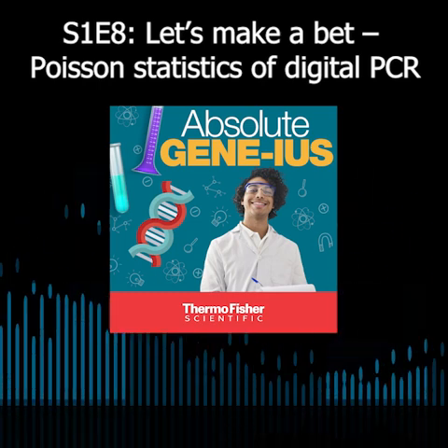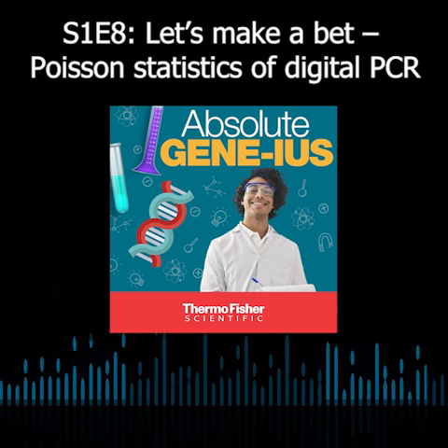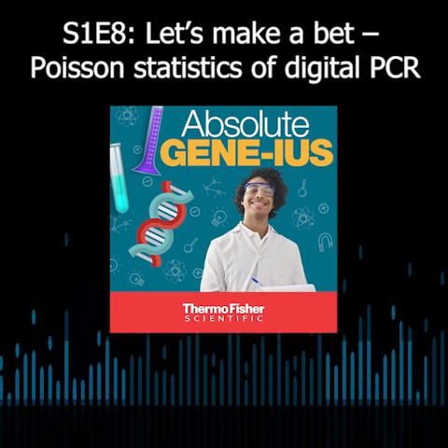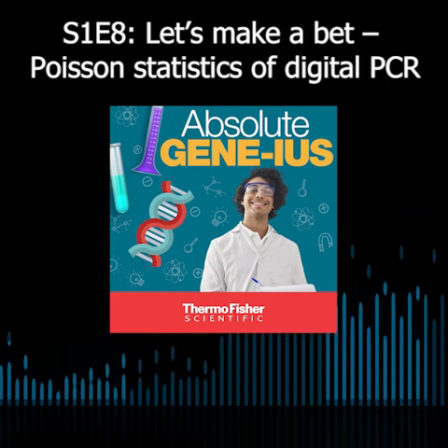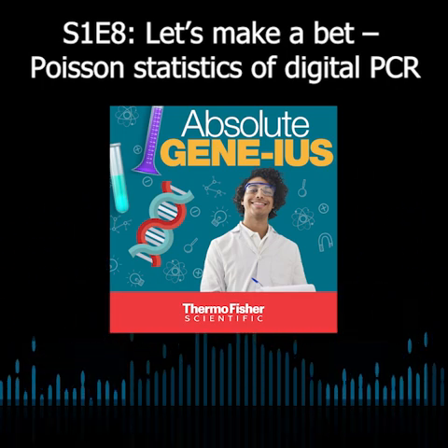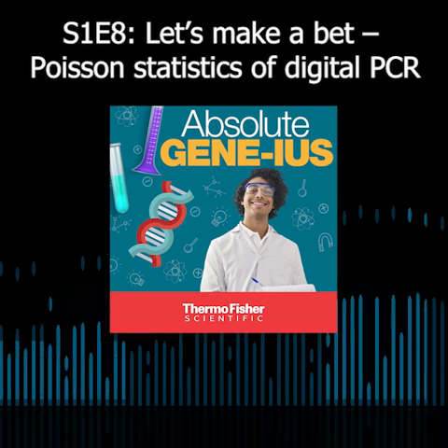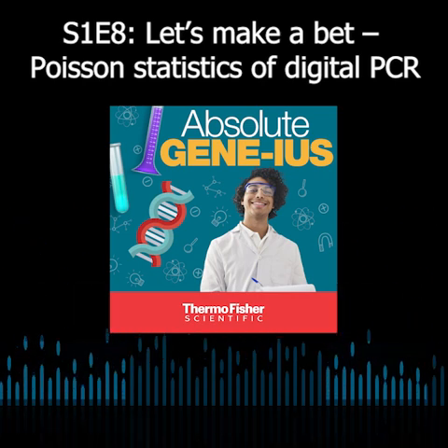Yeah, so there's a couple assumptions built into using Poisson statistics. And one of those has to do with the individual mini reactions all being the same volume. Because if there was a couple of them that were bigger than the others, well, they're going to be a little more likely to get extra DNA molecules than the small ones. So you'd have to account for that in your calculation if that wasn't the case. A lot of the systems assume that uniform size throughout the calculations, and I'm sure most vendors do testing to make sure that that's valid.